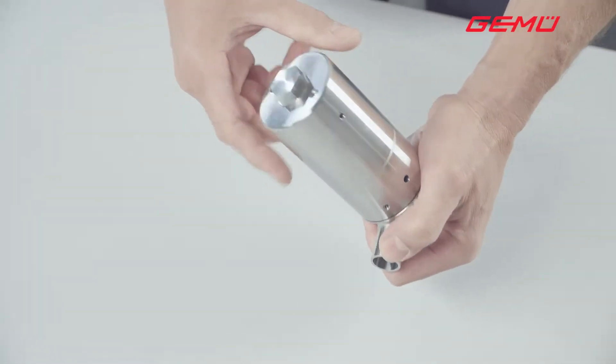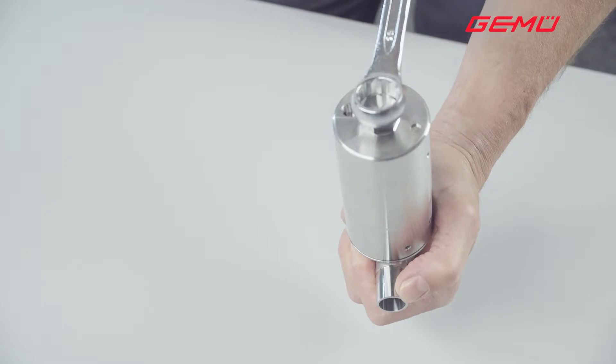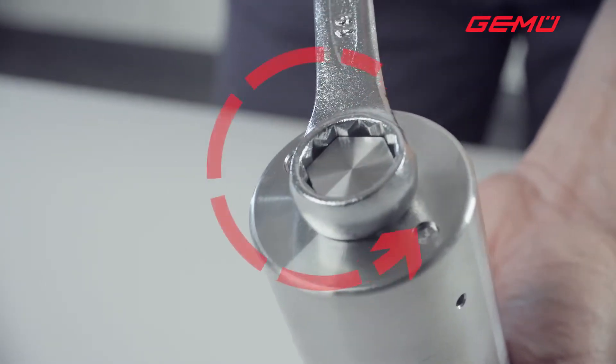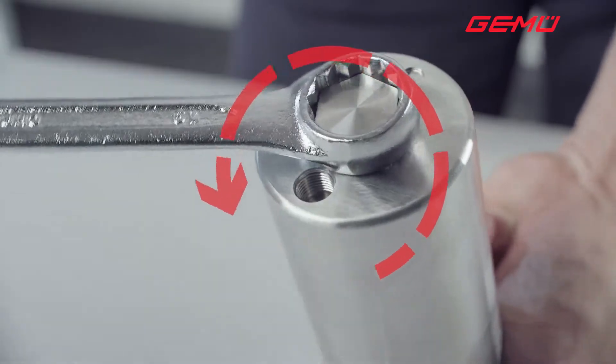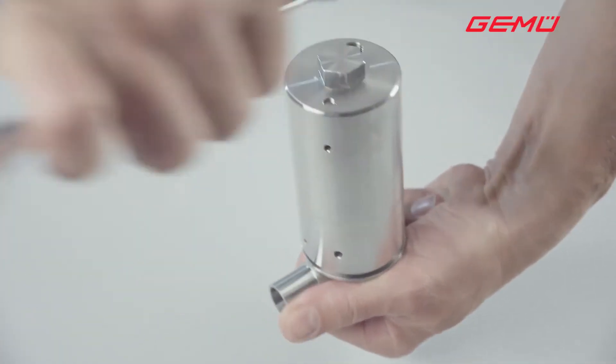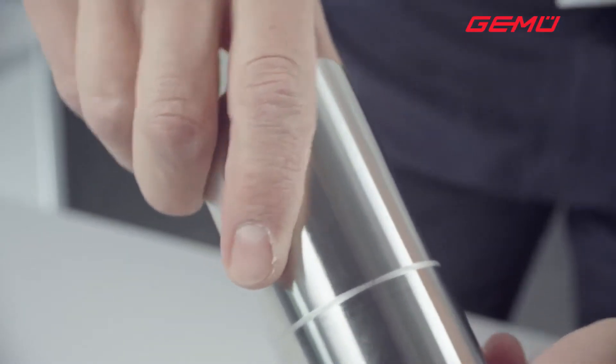The first step is to unscrew the actuator. To accomplish this, undo the actuator by turning the hexagonal point on the actuator cover anti-clockwise, using an appropriate tool, and then remove the actuator.